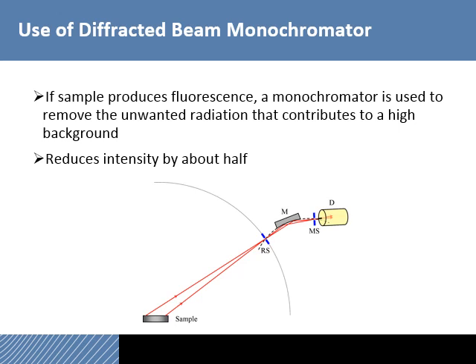So it's a trade-off. I think we discussed this in class a couple of times. I have one in my lab. I really don't use it very often. I actually just tend to run scans that fluoresce a lot longer, and then I just manually remove the background or reduce the background so it looks better. But either way is an acceptable way of dealing with fluorescence. Obviously, the other way, as we just discussed on the previous slide, is if you have access to a chrome tube, that would be a way of avoiding fluorescence, at least from iron.